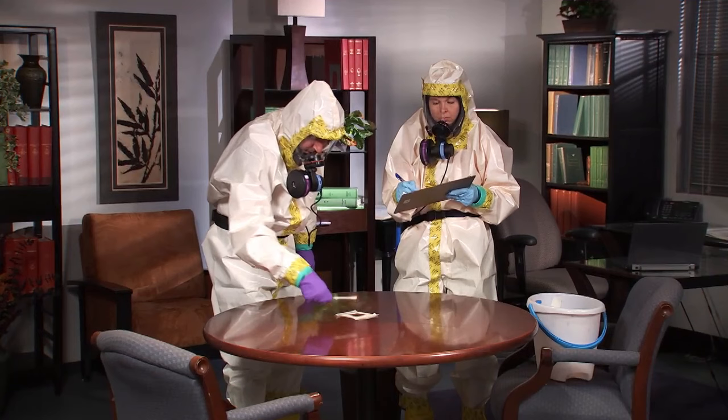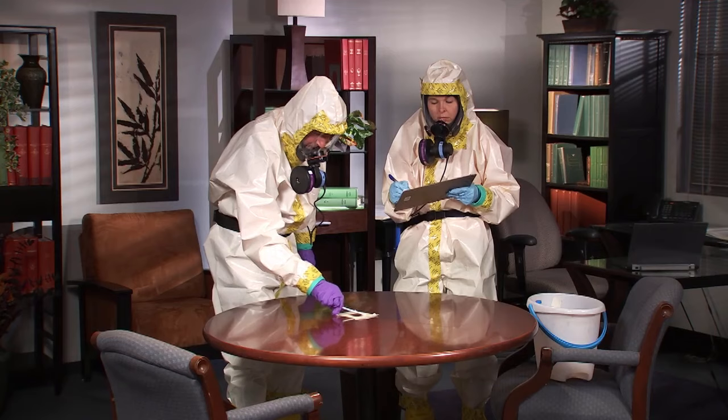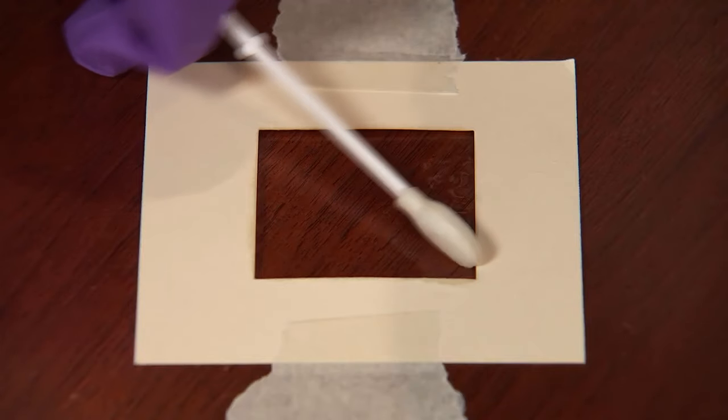In the third pass, the sampler rotates the swab to a clean side, places the side of the swab on the surface, and covers the area with diagonal S strokes.